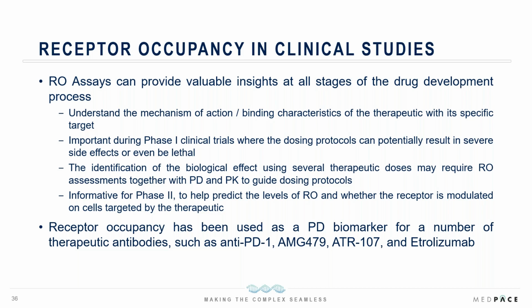We can use receptor occupancy assays during the identification of the biological effects using different doses, and then couple that with PK and PD assessments to guide dosing protocols.